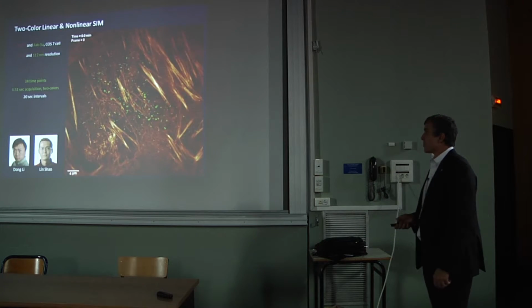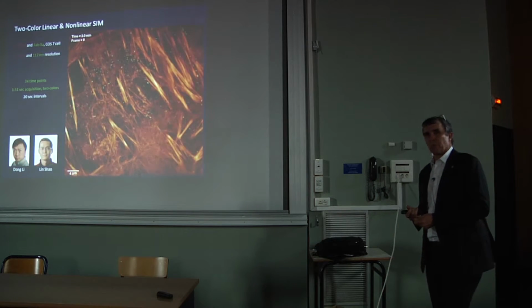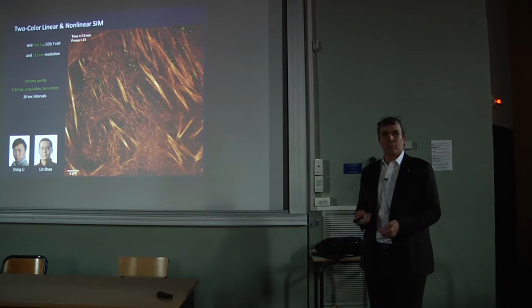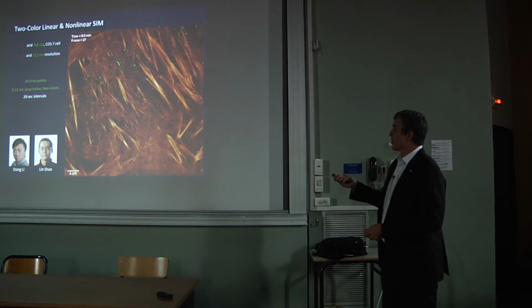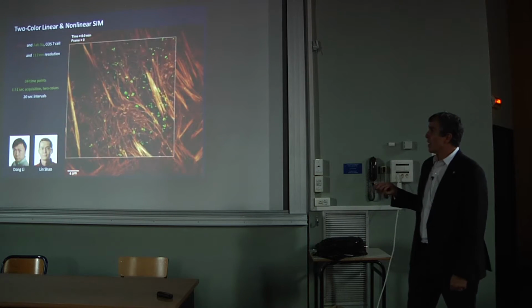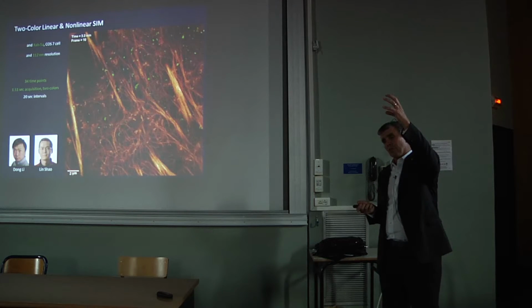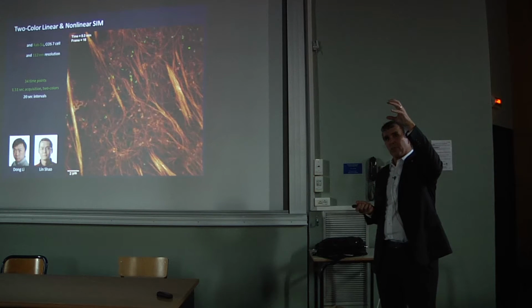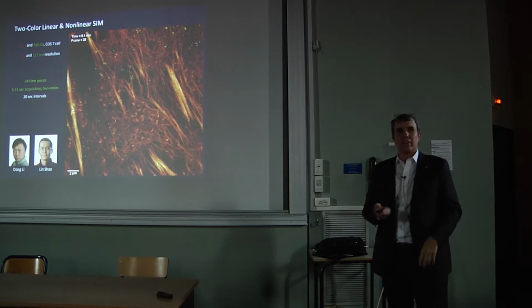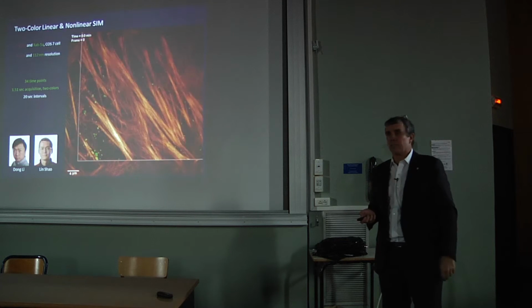that they claim. So we have only one good photo-switchable protein for this nonlinear SIM, but we can combine it with the linear SIM to do multicolor imaging. So this is an example where we're looking at the actin cytoskeleton again, and also RAB5A, which is a marker of early endosomes. So those clathrin-coated pits, once they pinch off and go in the cell, they mature into what's known as an endosome, the next step in the endocytic pathway inside of cells.